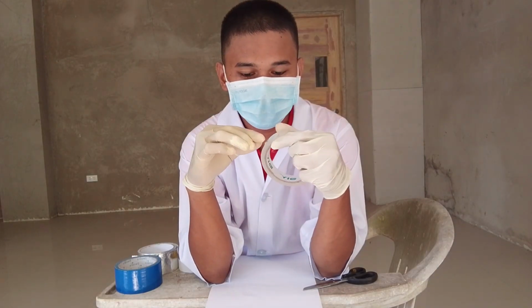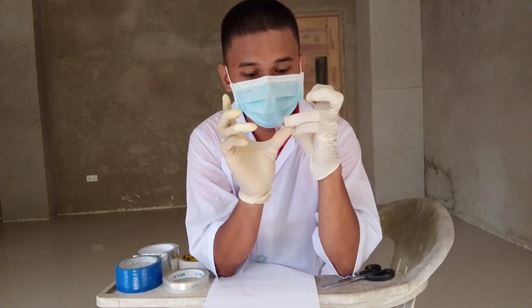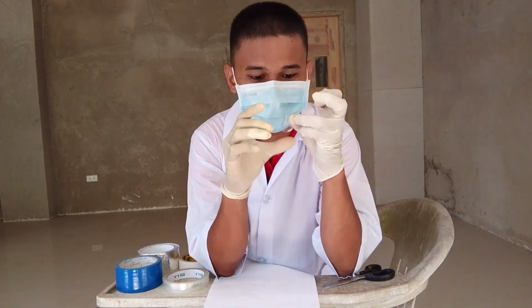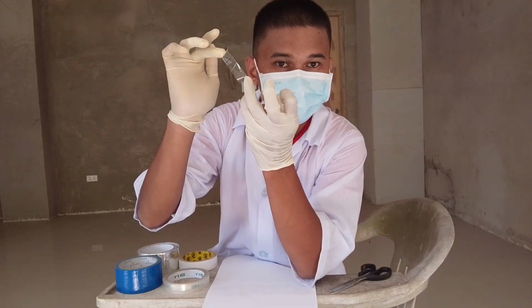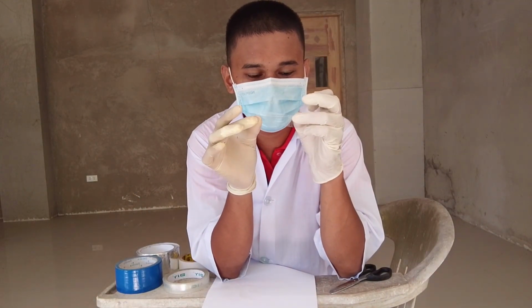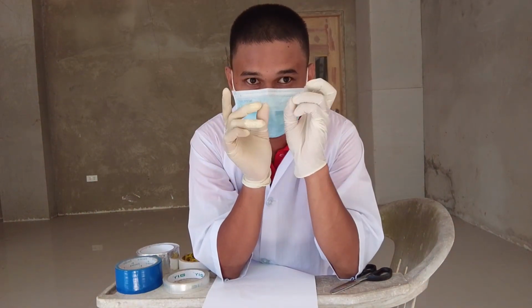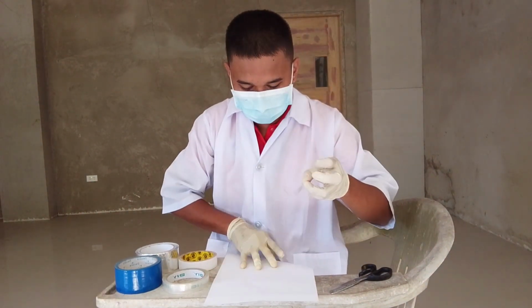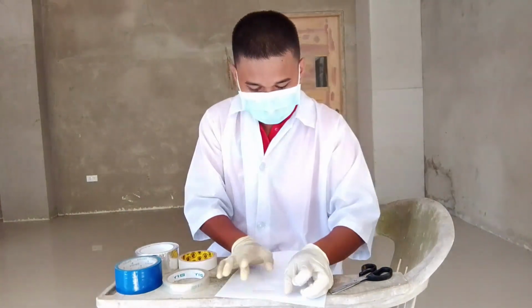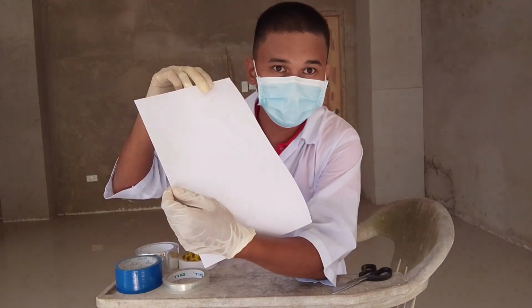Stationary tape is an adhesive tape commonly used for school works, school projects, office works, and crafting. So I will now get a sample. For the stationary tape, I have here 1 by 3 inches. The color of this is transparent, and the edge characteristic of the stationary tape is flat. I will now put the sample here in the paper. After putting the sample in the bond paper, I will now label it.